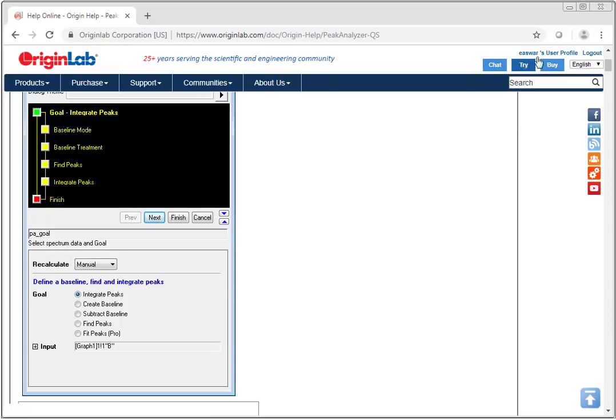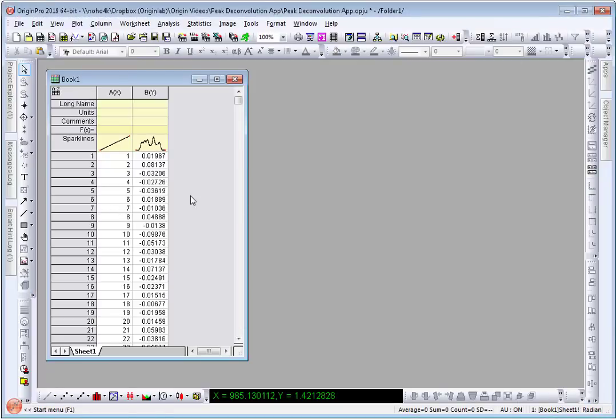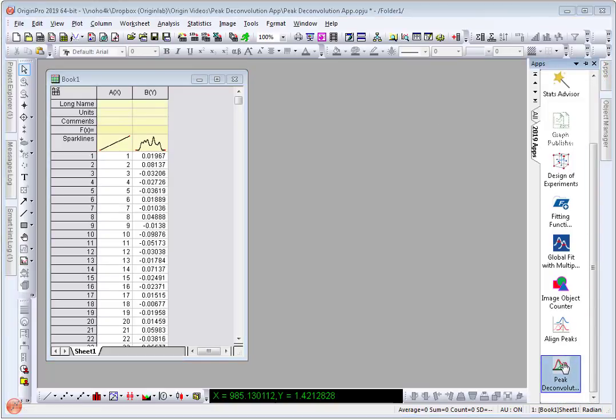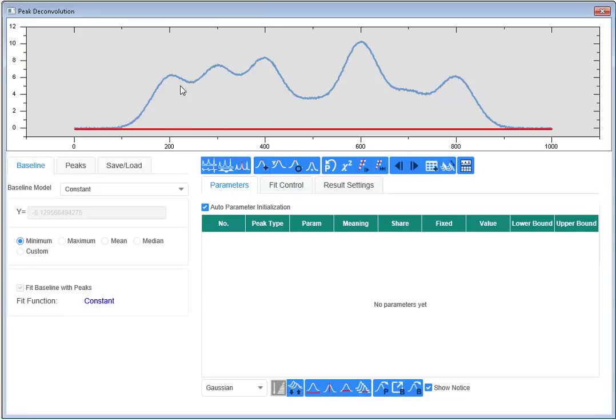With this in mind we created a new app called Peak Deconvolution which is available for Origin Pro starting in version 2019. Here I have my sample data which has noticeable peaks and some possibly overlapping peaks. I do not need to subtract the baseline for this data, however there is an option to set the baseline from multiple methods.